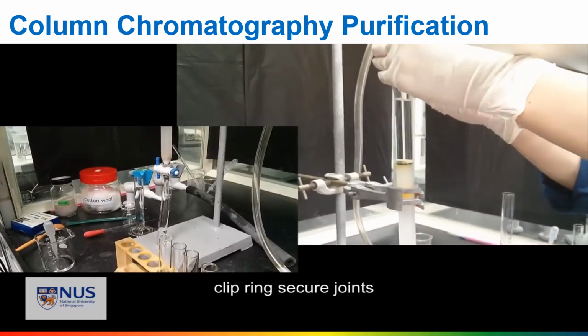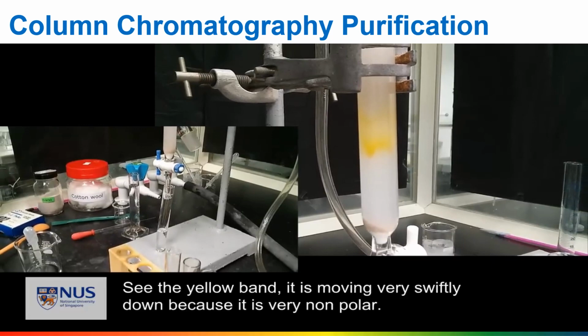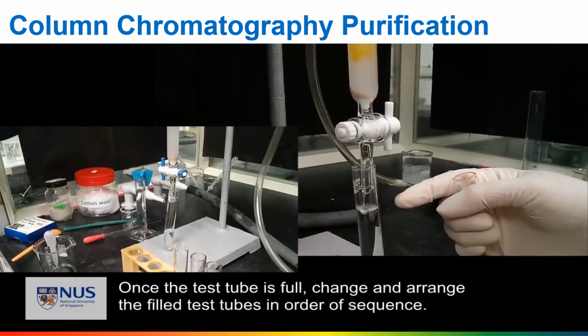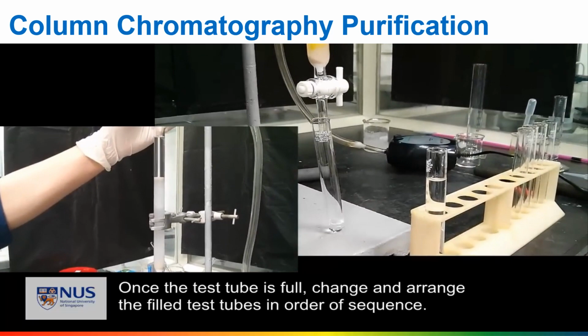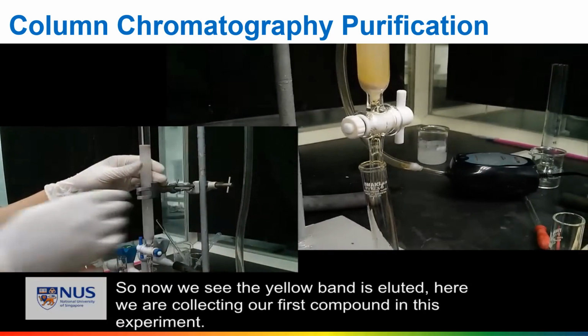See the yellow band? It is moving very swiftly down because it's very nonpolar. Once the test tube is full, change and arrange the filled test tubes in order of sequence. So now we see the yellow band is eluted. Here we are collecting our first compound in this experiment.